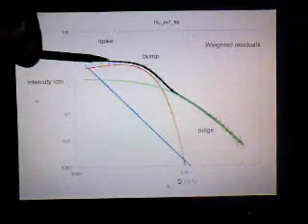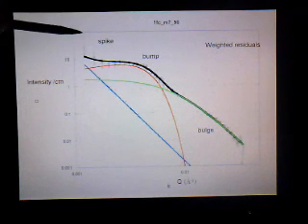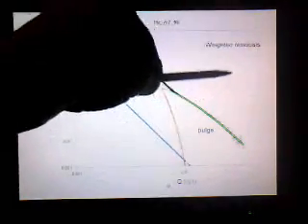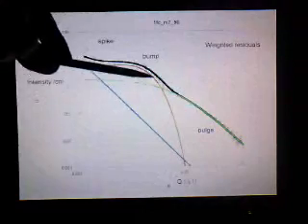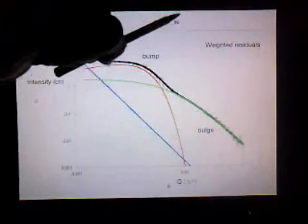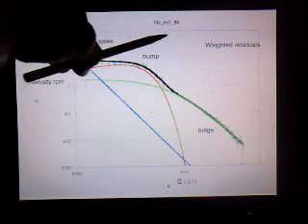The difference between the black curve and the data point, divided by the standard deviation, by the error bar, that quantity squared is the weighted residuals, and you can see those by the rose-colored plus signs. If they're fairly evenly distributed, that's a good sign. This information here tells you the conditions of the particular measurement.